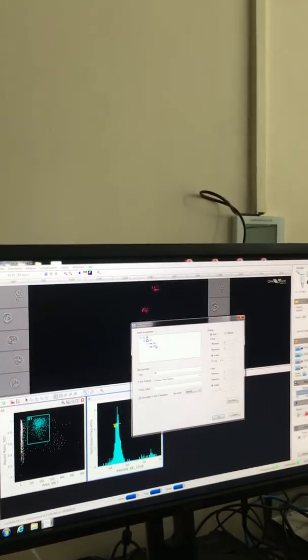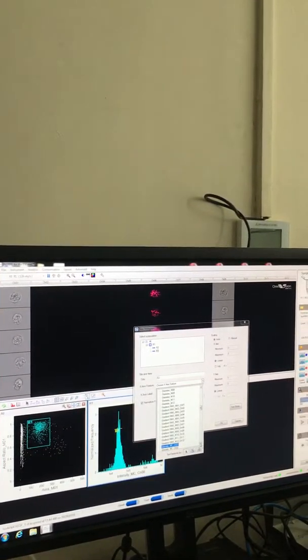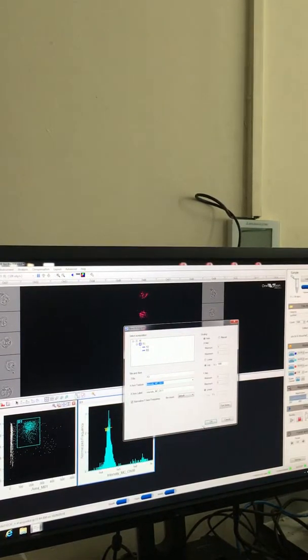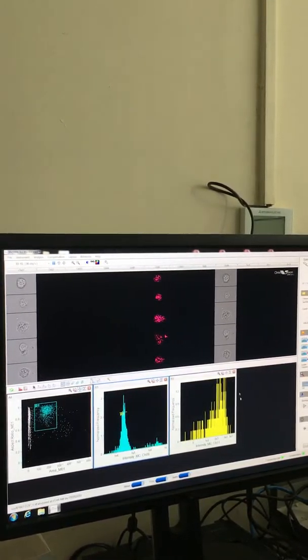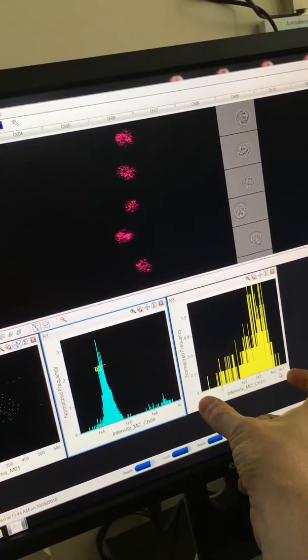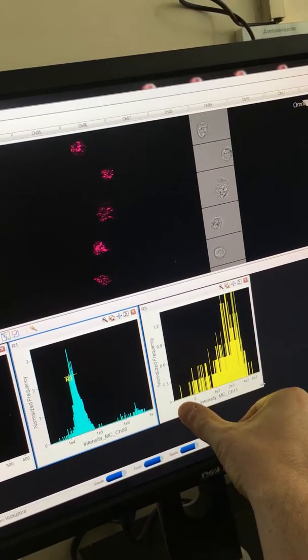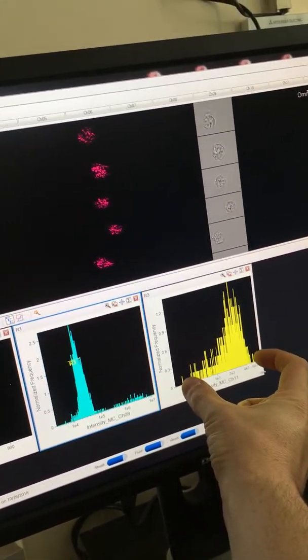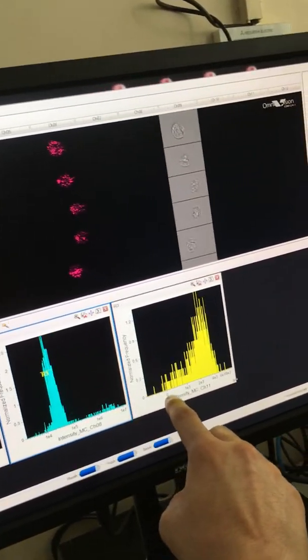Then click on R3, and change the X-axis to intensity of channel 11, which is the AF6. There we go. So this is your negative population. This is different to a cytometer. This is adaptive. On a cytometer you'd see the whole intensity scale, and you'd have the peak at the bottom. With this, it adapts. So if you can only see negative, the scale gets cut off, so you can look at the log scale.